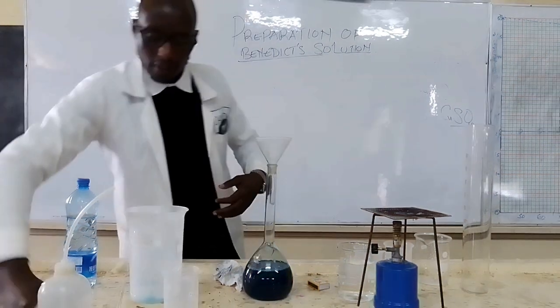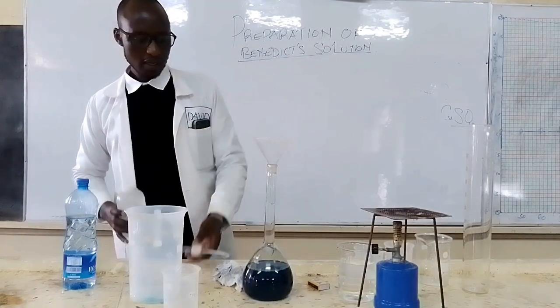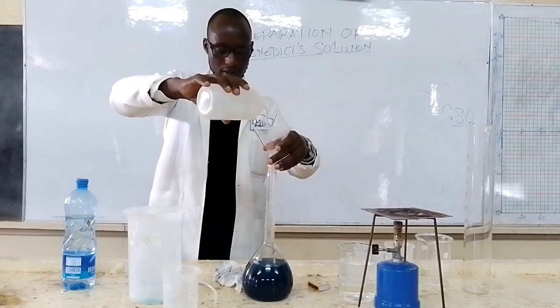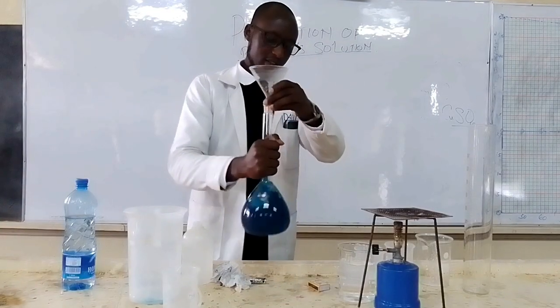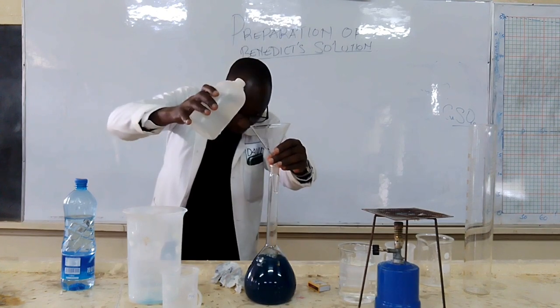Now what follows is actually to top up the solution to 1 liter, to the mark. Then we shake to allow the mixture to form a uniform solution.